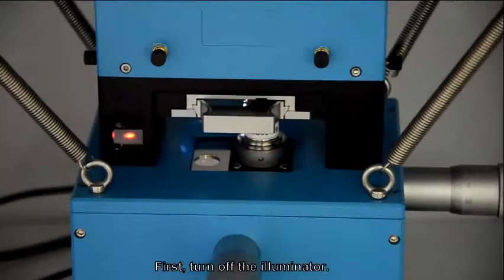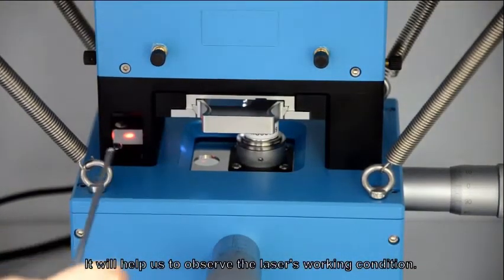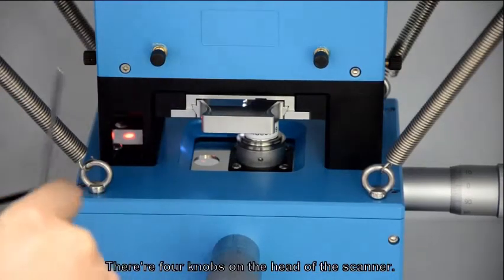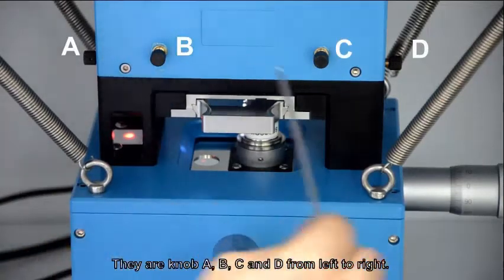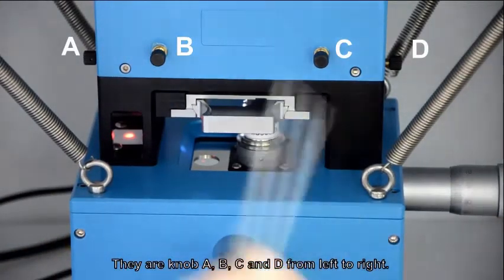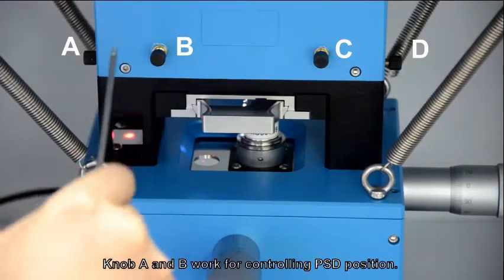First, turn off the illuminator — it will help us to observe the laser's working condition. There are four knobs on the head of the scanner: knob A, B, C, and D from left to right.